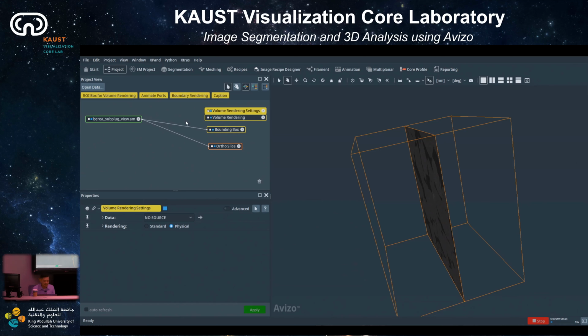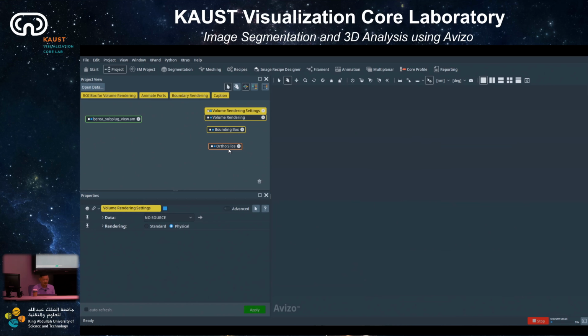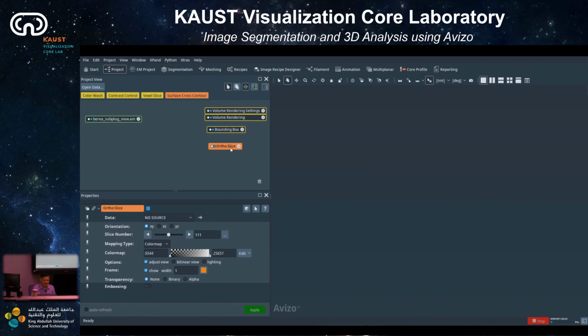Again, if I go to the bounding box, I pull the string and release it, and pull and release it, something like this. So it's gone, disconnected. This can be done the same way if you would like to connect them again. You can go to the little white box here, and when you click on the little white box, you can see that they have the data. It's the same as here.